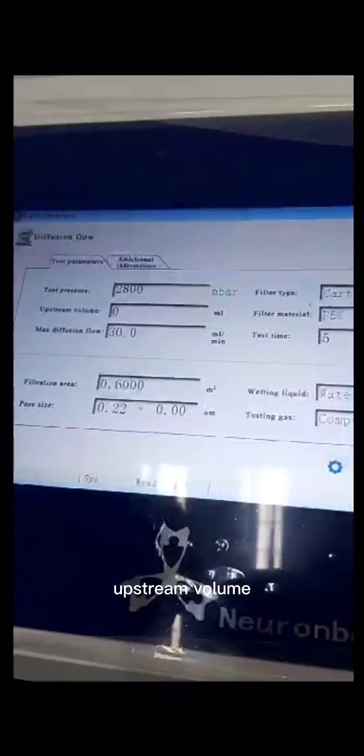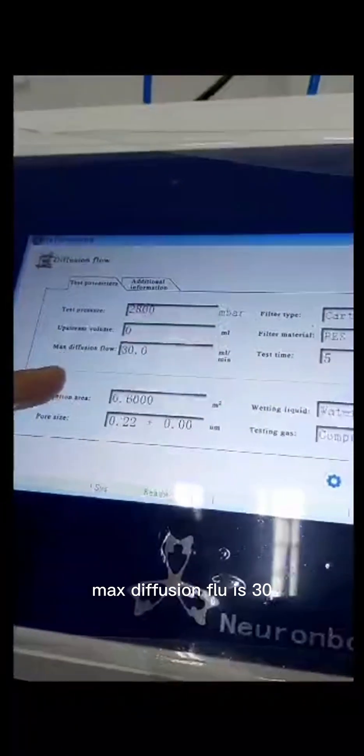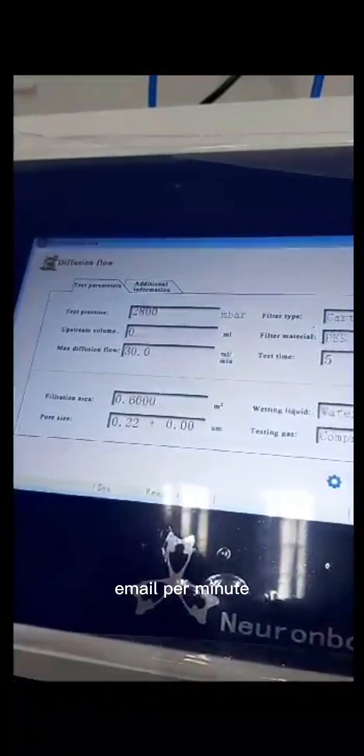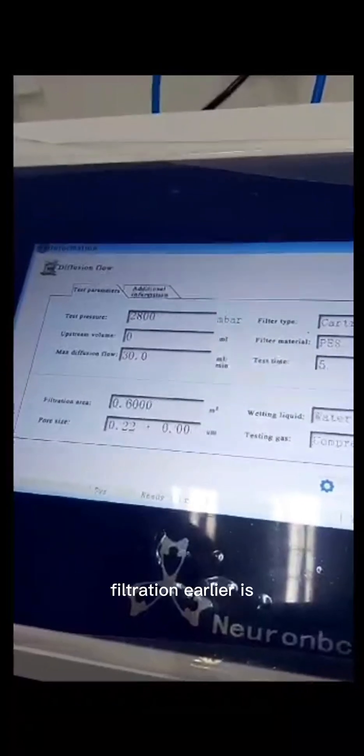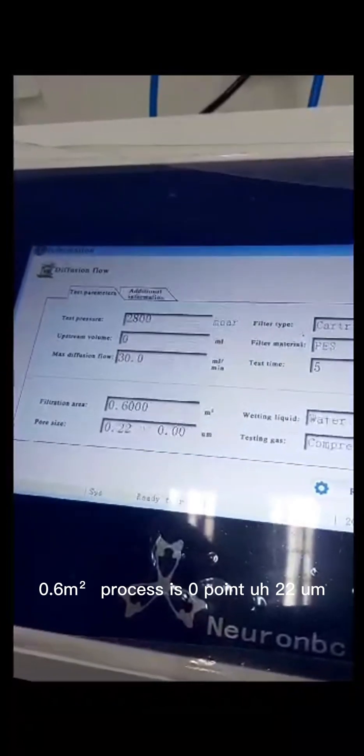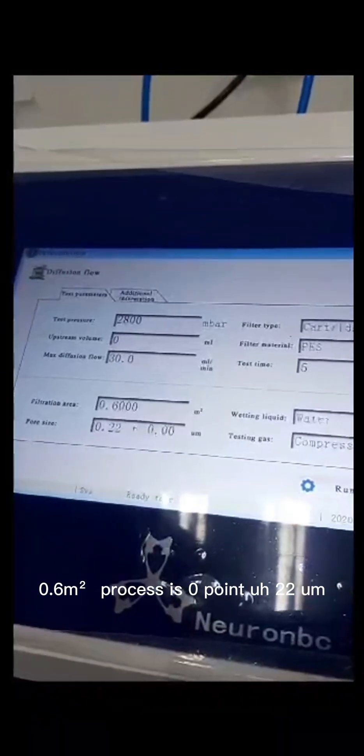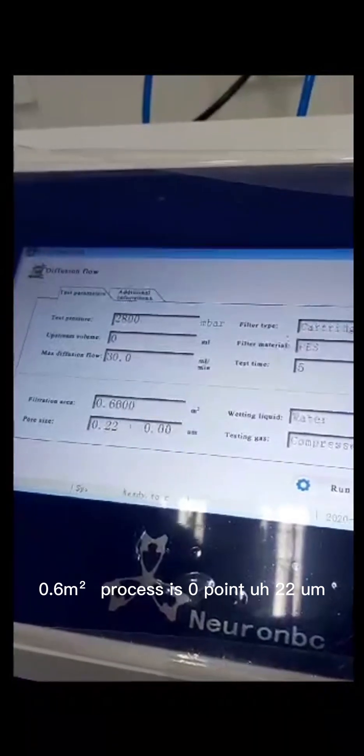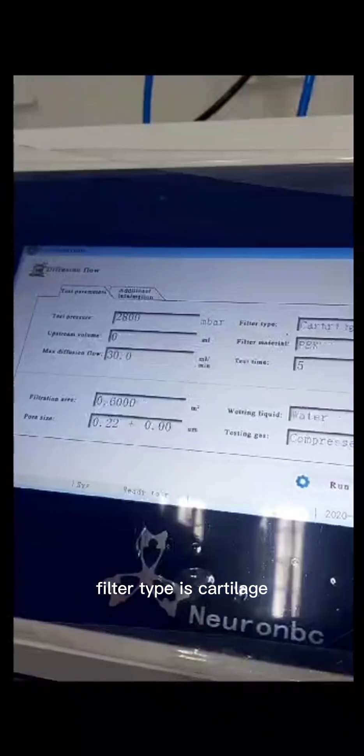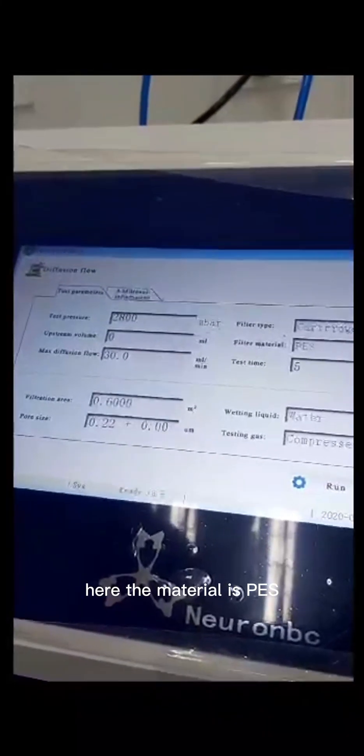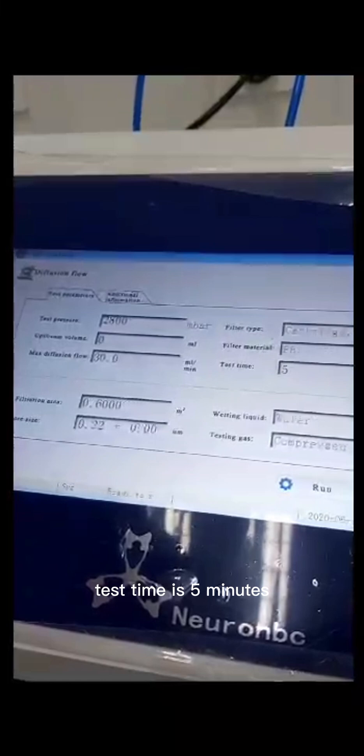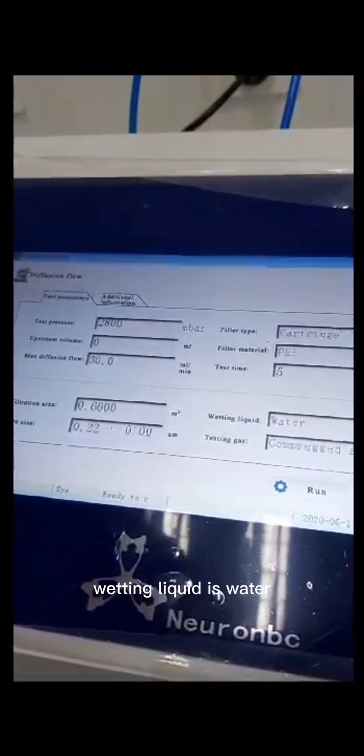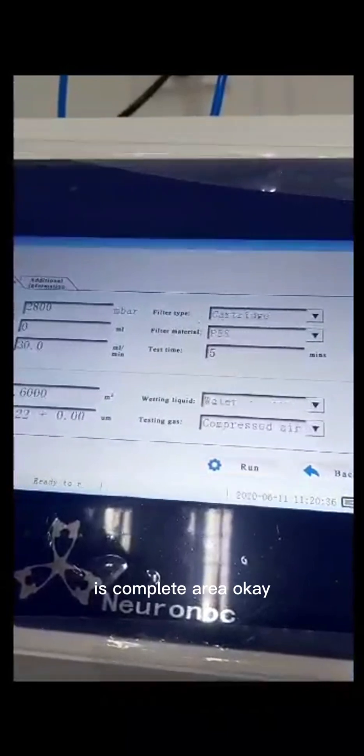Upstream volume. Max diffusion flow is 30 ml per minute. Filtration area is 0.6 square meter. Pore size is 0.22 U.M. Filter type is cartridge. Filter material is PES. Test time is 5 minutes. Wetting liquid is water. And test gas is compressed air.